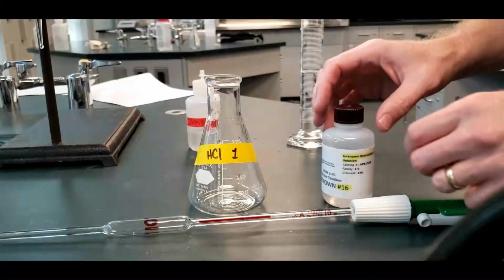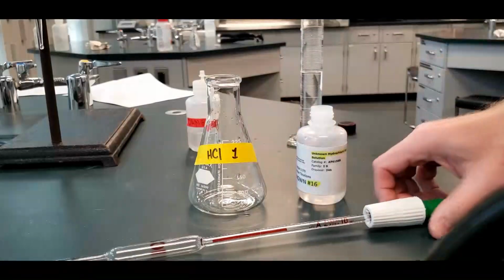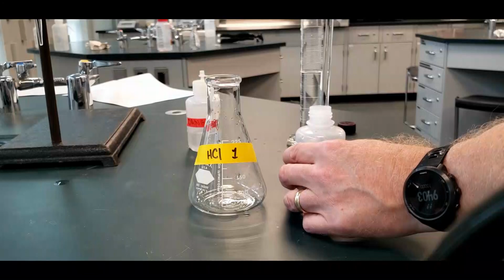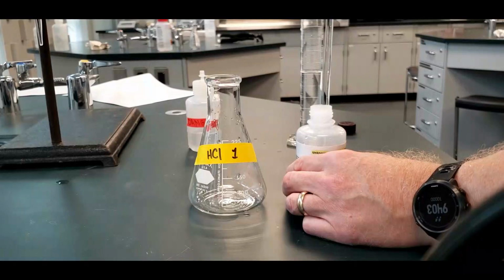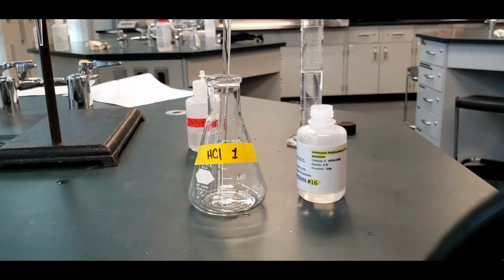And here's the preparation of the HCl unknown that's here. So we don't know what's in it, that's what we're going to determine now that we know the concentration of our sodium hydroxide. Use this 10 ml pipette. Dial up 10 mils of HCl. Just fight me a little bit. That's good. Go. And then we're going to take this over here, and in we go. So that's 10 mils of the HCl.